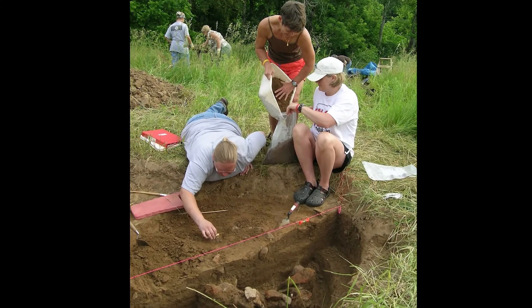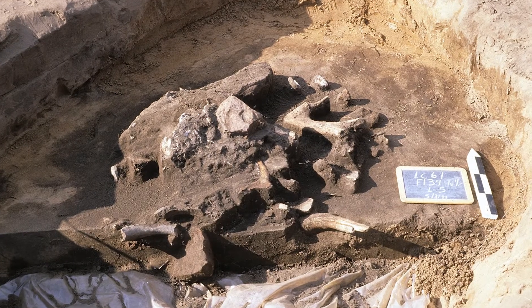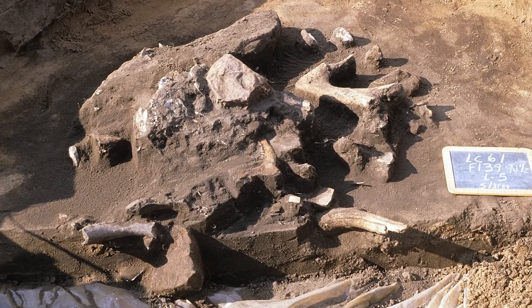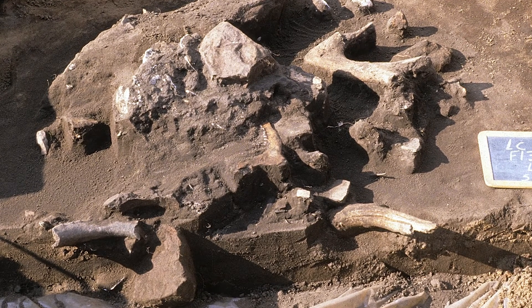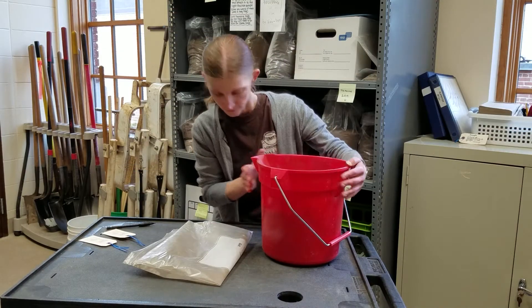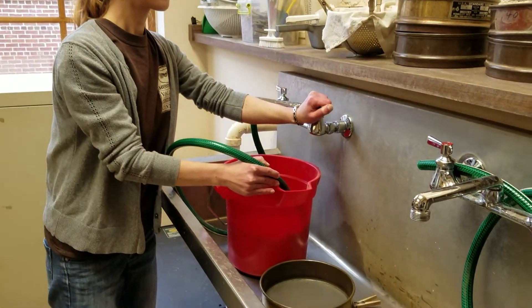So we take soil samples from locations of interest, such as the different deposits in these pit features, once used for refuse or storage. We dry the soil out, measure its volume, and then immerse it in water.